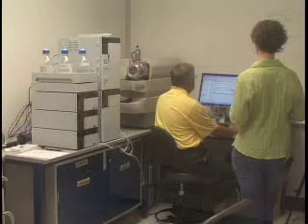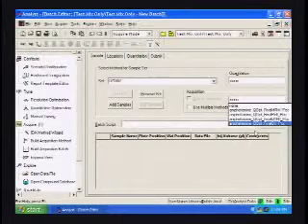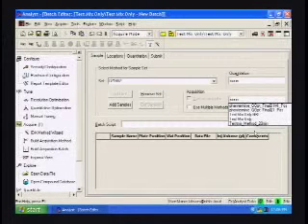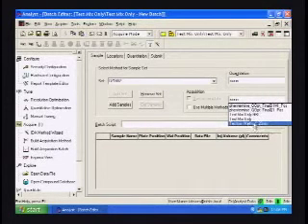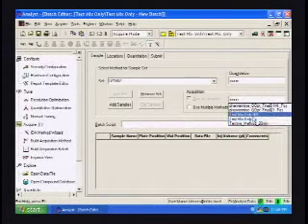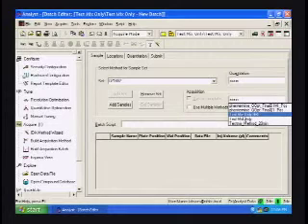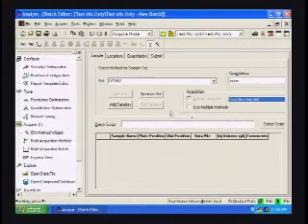Let's see if it'll scroll down. There you go. What method were we using? Test mix only GVI. That's the one. Okay, we've selected a method here.